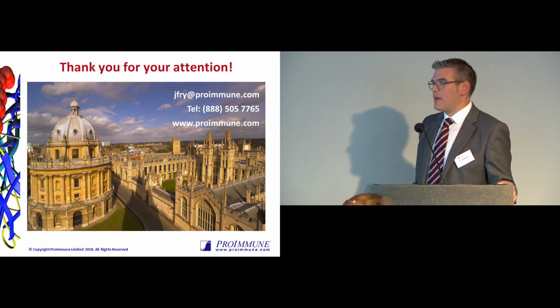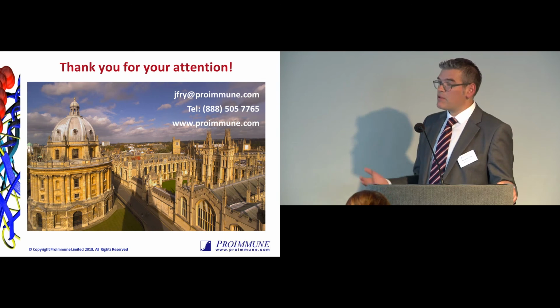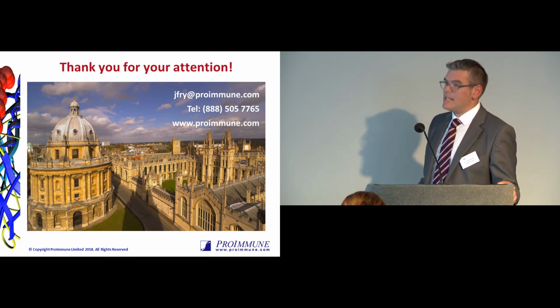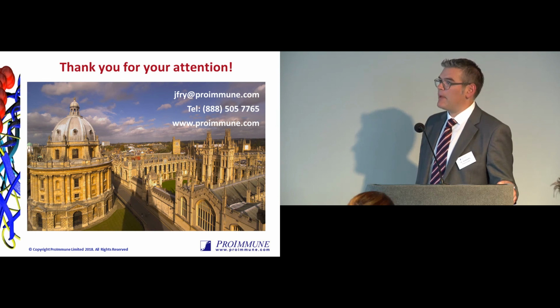But in answer to your question about the agency, they have seen data from all of these different assays, most of all the ProStorm assay, but also the DCT T-cell assay and the MAPS assay. We've never had any comments back in relation to that. Obviously there are always questions of how to interpret data, but we've not had any specific questions back that that's an issue or a particular problem. Yeah, thank you.